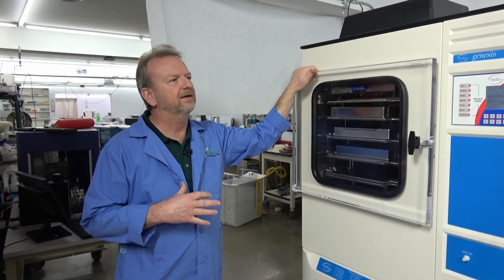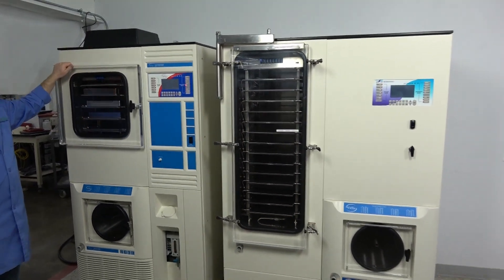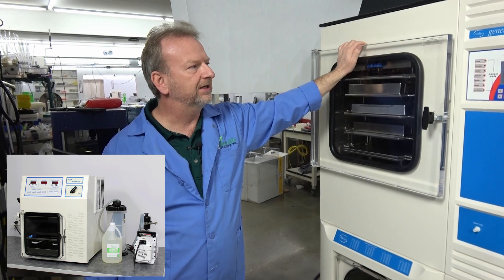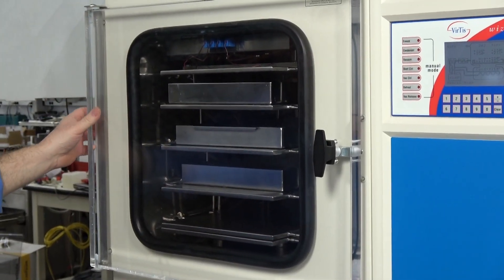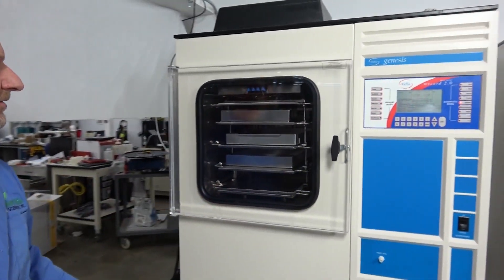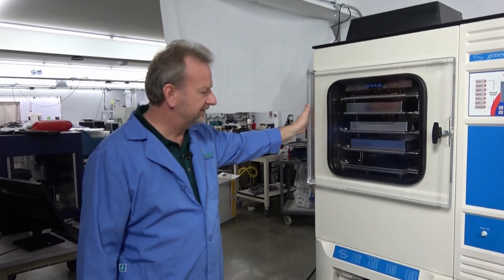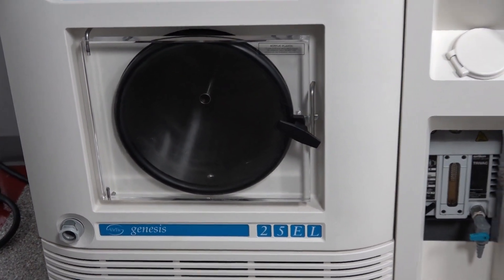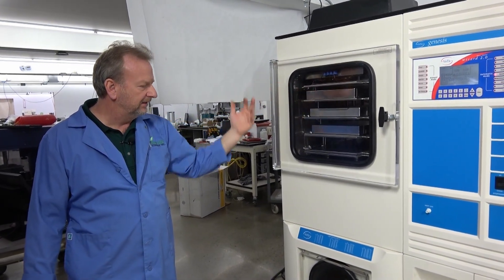We have two pretty nice sized units here on the floor, and we also have a bench top unit — the Advantage — which we'll insert a photo of. The Advantage is a little bit smaller than the Genesis as far as the capacity inside the freeze-drying chamber. This Genesis unit has five shelves, allowing more production, and it has a much larger condenser capacity — 25 liters — so you don't have to stop and defrost as often, and there's plenty of room to pull down all the moisture.